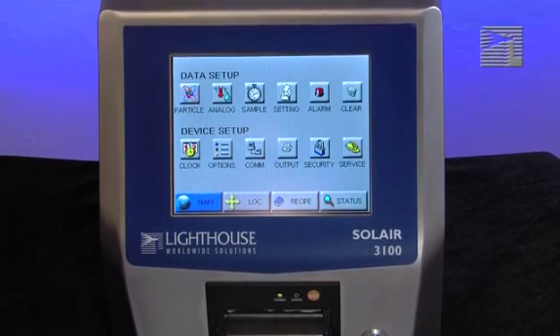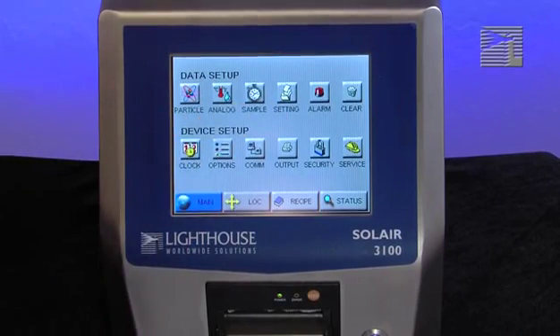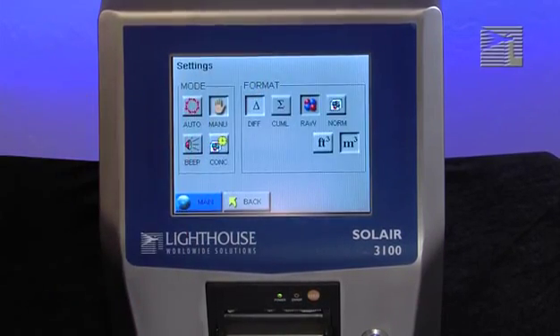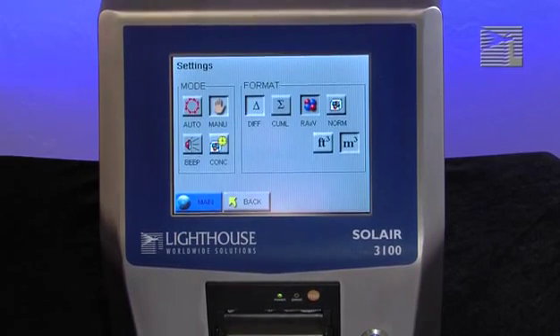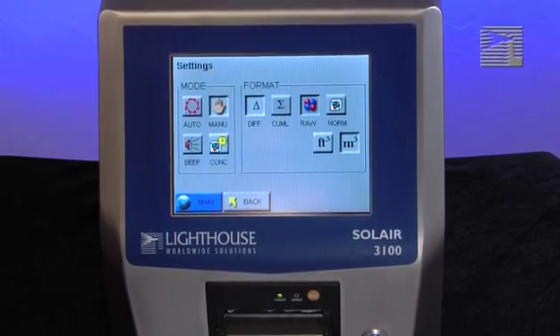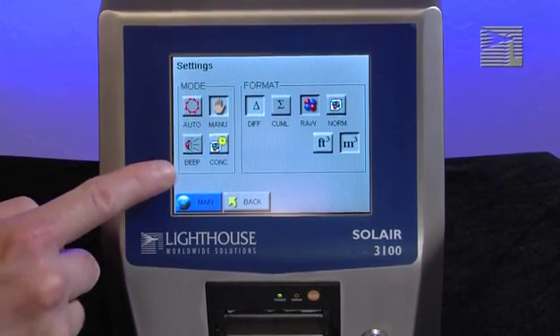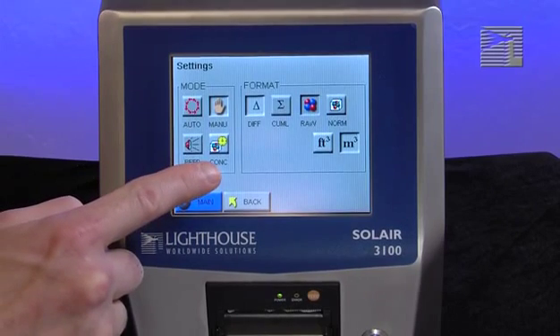Now press the settings button, which is the button that looks like a folder with papers going into it. You will see two sets of buttons: mode buttons and format buttons. There are four buttons in the mode section. They are Auto, Manual, Beep, and Concentration.